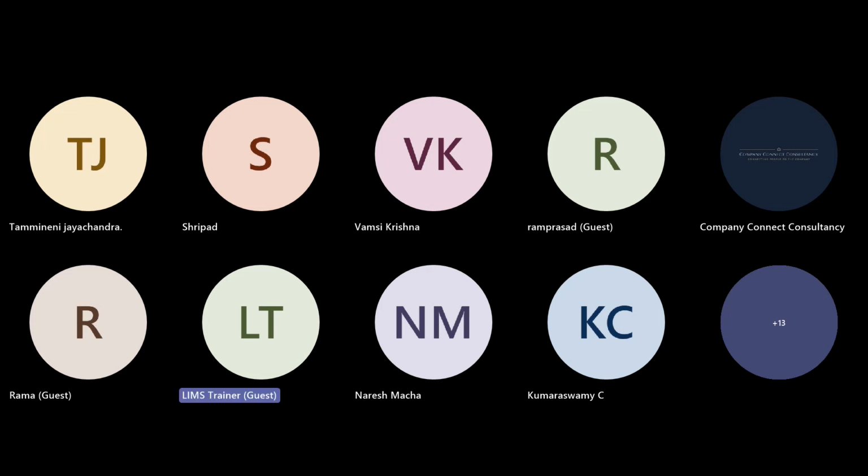That is from the lab LIMS perspective, of course, not from others. But similarly, you can use your knowledge to figure that there should be some other table or some other module where you can configure that or make that field mandatory. That's my point.